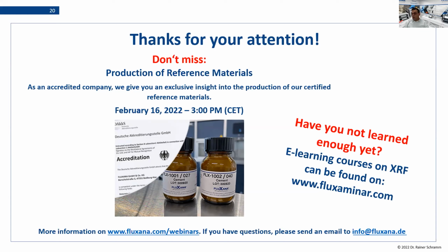And the same for tar, also this is possible. Tar is a bit difficult to prepare. You have to warm it up first, perhaps to pour it into a sample cup, then let it cool down, and then you can analyze it. Yeah, so this would be the way to do it.